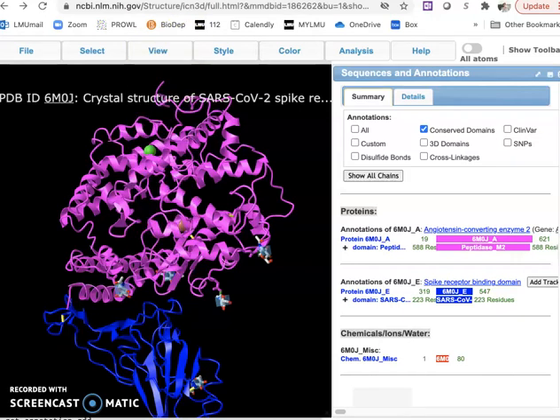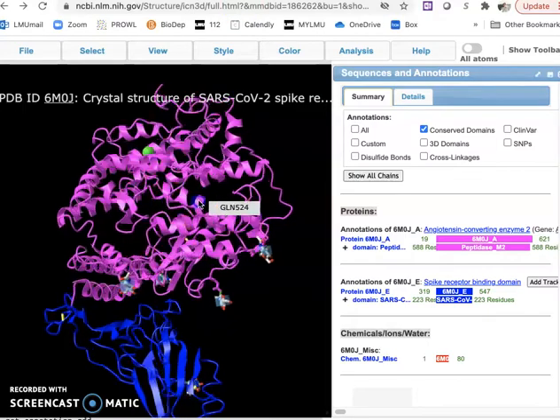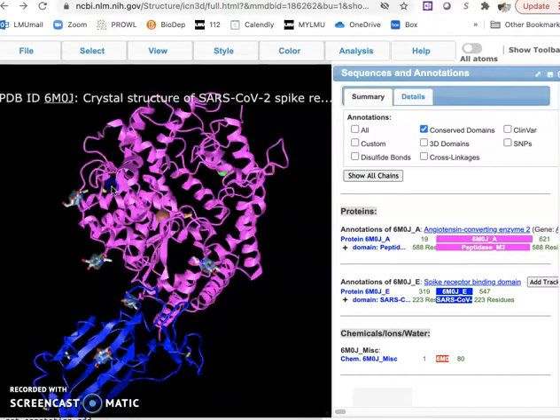Hi everybody, I just wanted to go over some features of iCN3D that we practiced using last week that I think may be helpful for your upcoming project. The first thing we did is to visualize the AC2 receptor in pink and the spike protein, part of the spike protein, in blue.